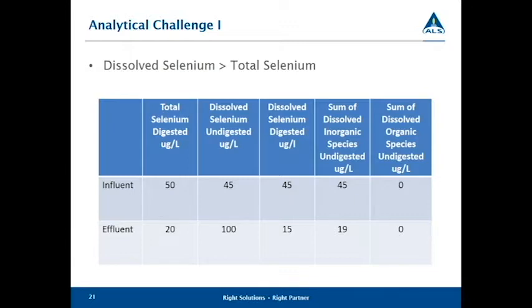And so by doing that, you will then see this dissolved number come back down to some level, hopefully below the total. It'll certainly be close, and it certainly won't be orders of magnitude greater than your total. So that's the first one of the first challenges.